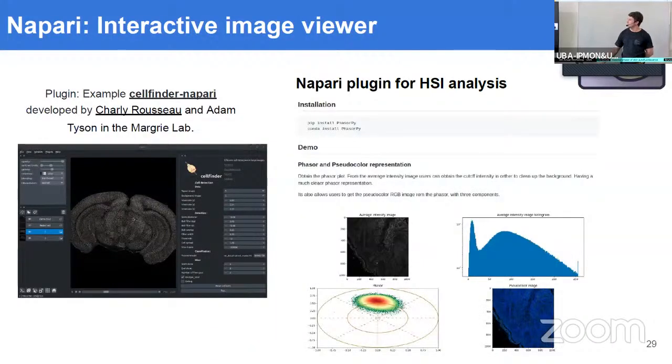And then there is a little thing. Many of you don't program, right? So you're going to tell me that that's great, but I can't use Python. So what's the solution for that? It's Napari, which is an interactive image viewer. It's essentially that you download it and you click things to do the processing, like ImageJ. So we also got funded to do this. This is for a year, so in a couple of months, I hope to have the first version. You can try it.